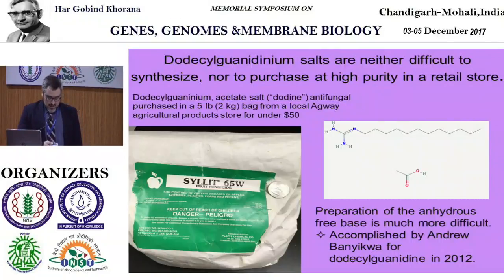And then once these completely anhydrous crystals were formed, to never expose them to water again: dissolve them in alcohol and deprotonate with potassium t-butoxide, then evaporate off the methanol, and take the crystals, which at that point still contain a little bit of methanol, and again recrystallize them from acetonitrile. And this manages to remove all of the water. This was the first preparation that actually gives an elemental analysis that matches that predicted for the free base.